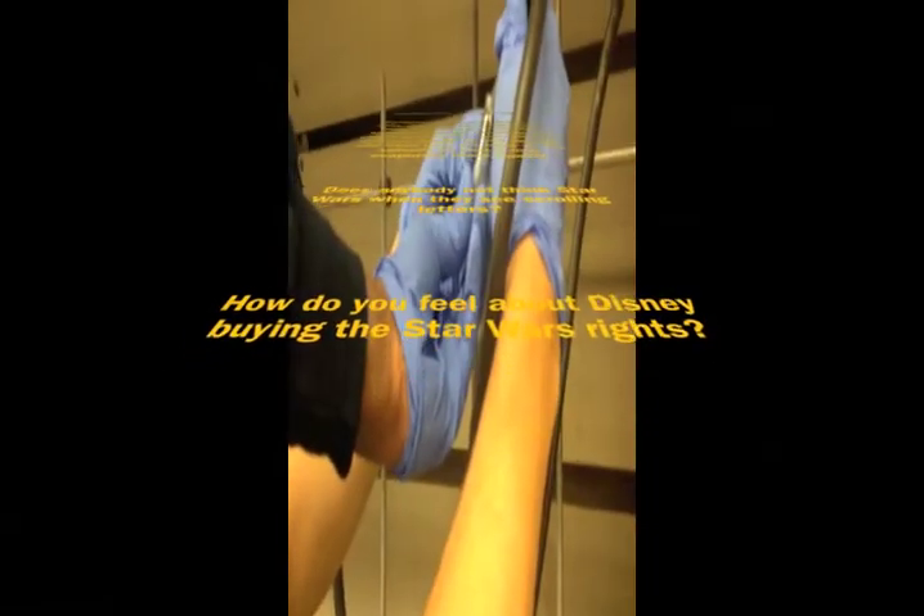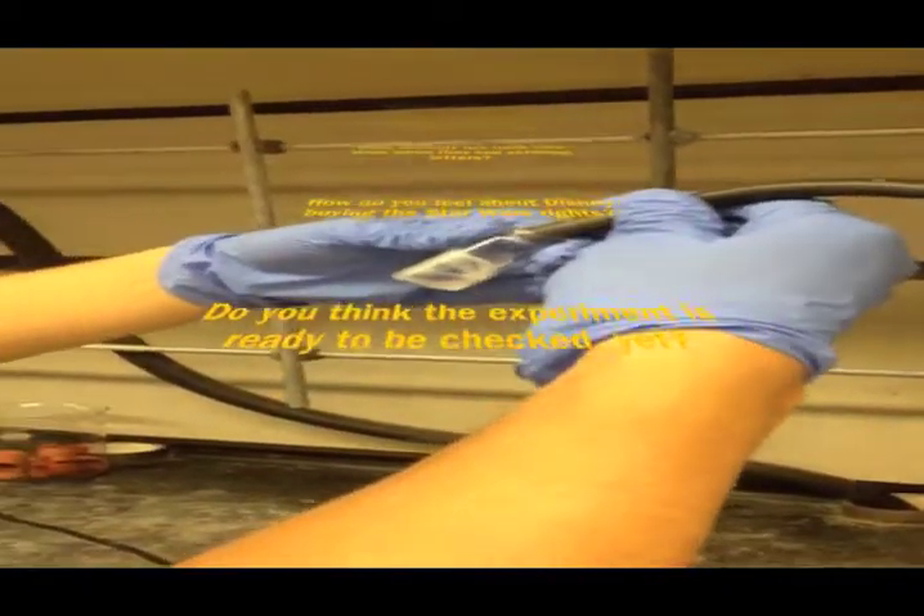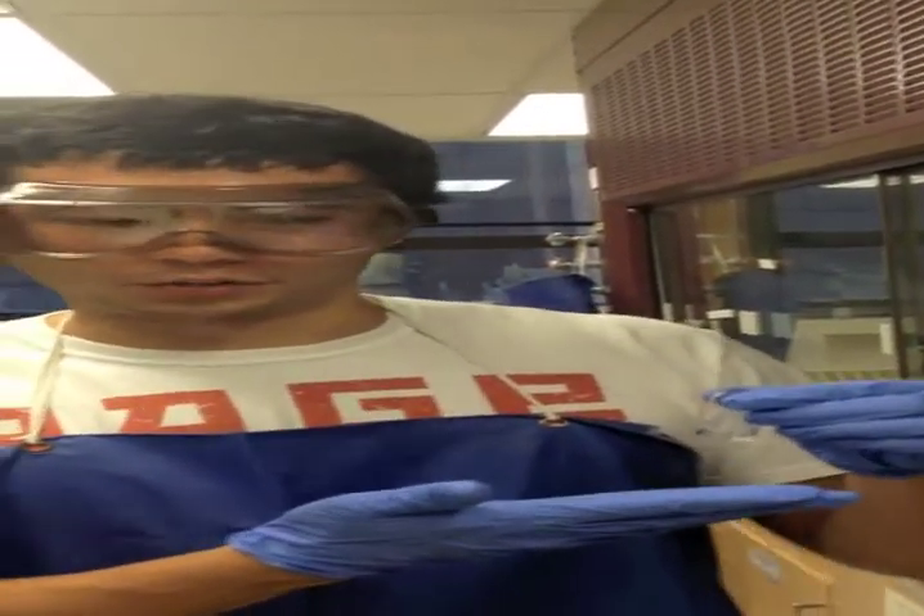If you have your thermal vision on, you can see the heat going from my hand to the vial. As you can see, the solvent is almost completely evaporated. The residue forming on the inside of the vial is the leftover solute. We know the solvent has completed its evaporation when the vial begins to warm back up to room temperature.